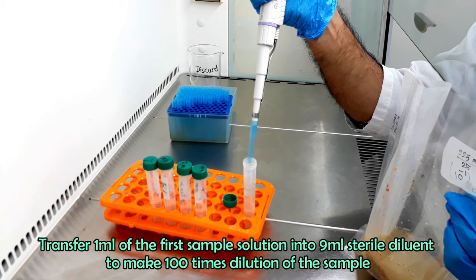These two plates are for the dilution 10 inverse 2. Vortex the dilution tube. Transfer 1 ml from 10 inverse 2 dilution into trial 1 plate. Transfer another ml from 10 inverse 2 dilution into trial 2 plate. In this way, prepare all the dilution plates.